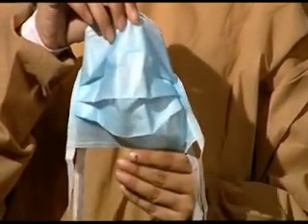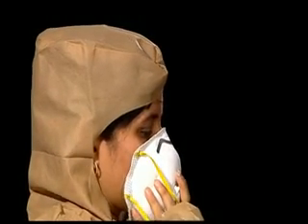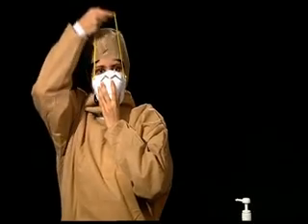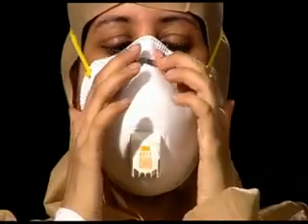Normally, medical workers are required to wear a 3-layered surgical mask, but in the eventuality of dealing with live virus or suspected patient, it is advised to wear a particulate respirator such as the N95. To put on the N95 respirator mask, place it on your face in a manner that it covers the nose and the mouth. Using the other hand, pull the lower string over your head. Once the lower string is comfortably placed, repeat the same action with the upper string. Once the strings are in place, use the index fingers of both hands to firmly clasp the metallic clip over the nose. This would custom fit the respirator over your face and will ensure safety.